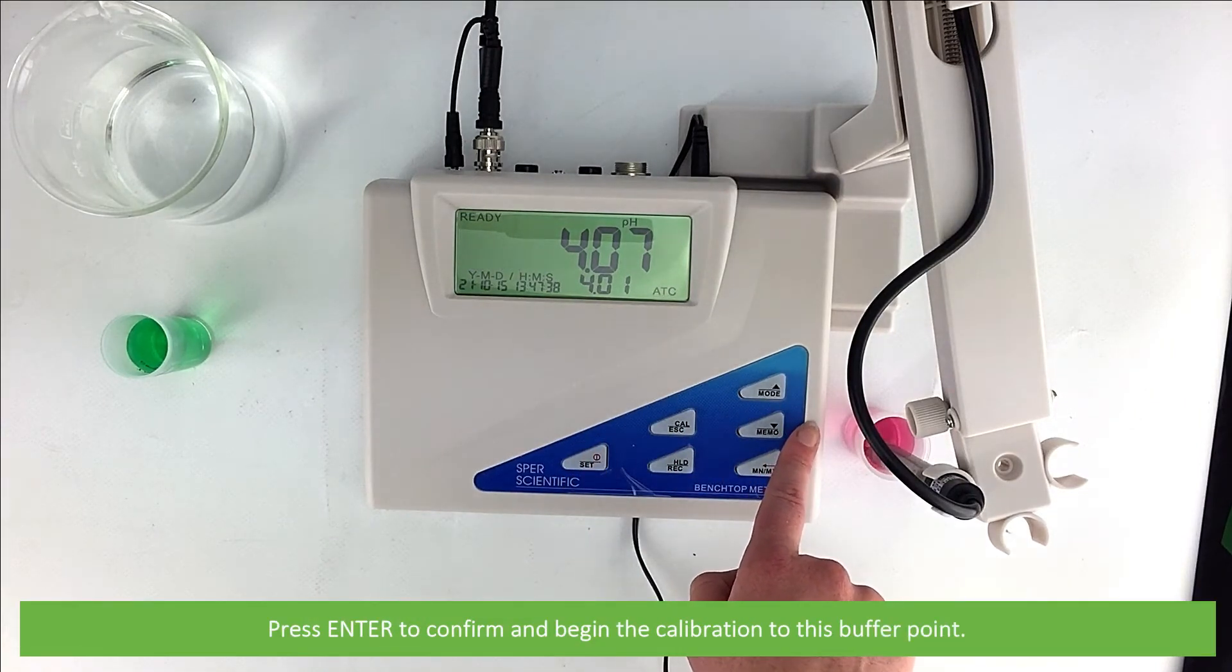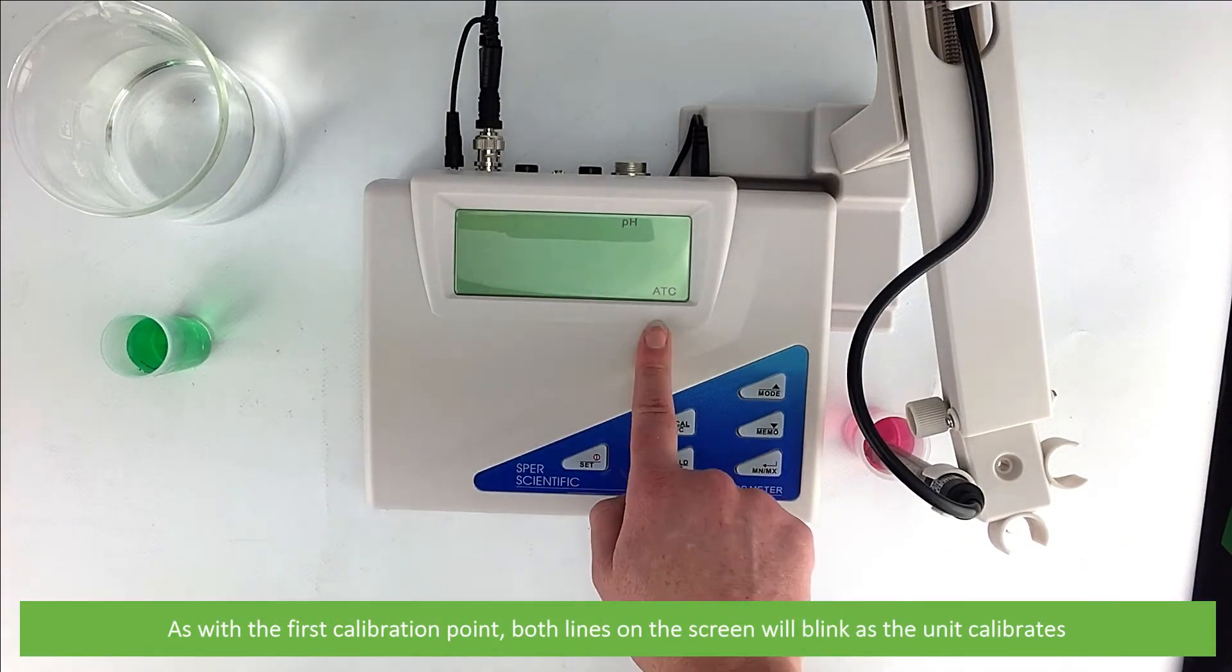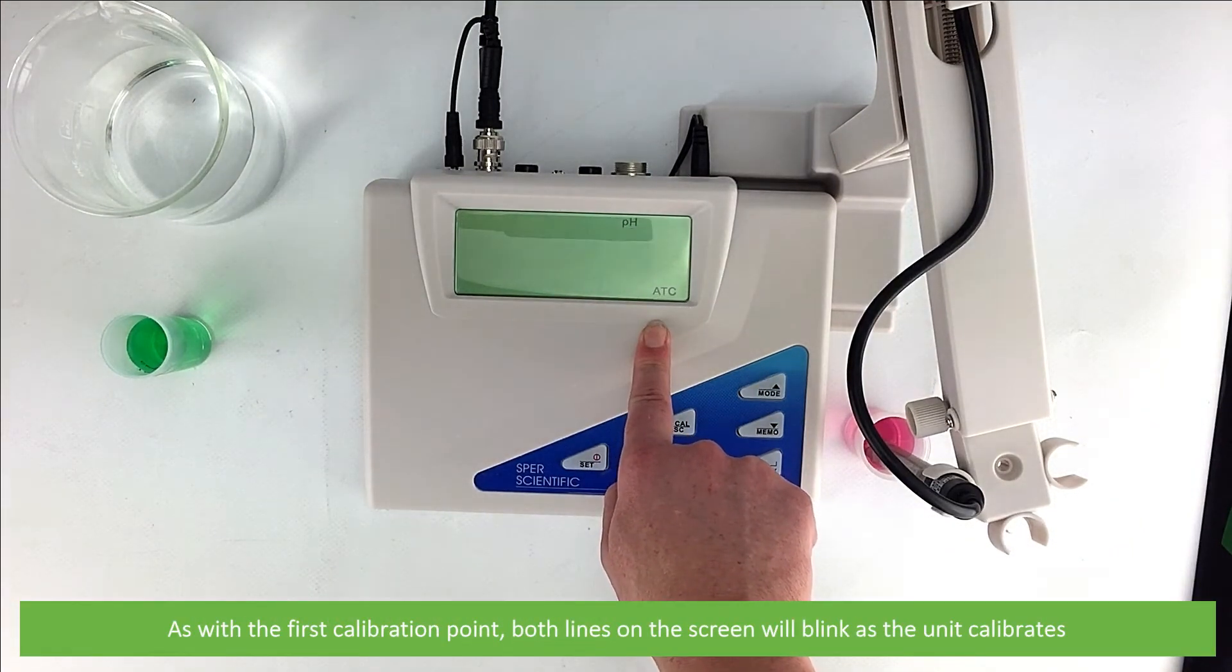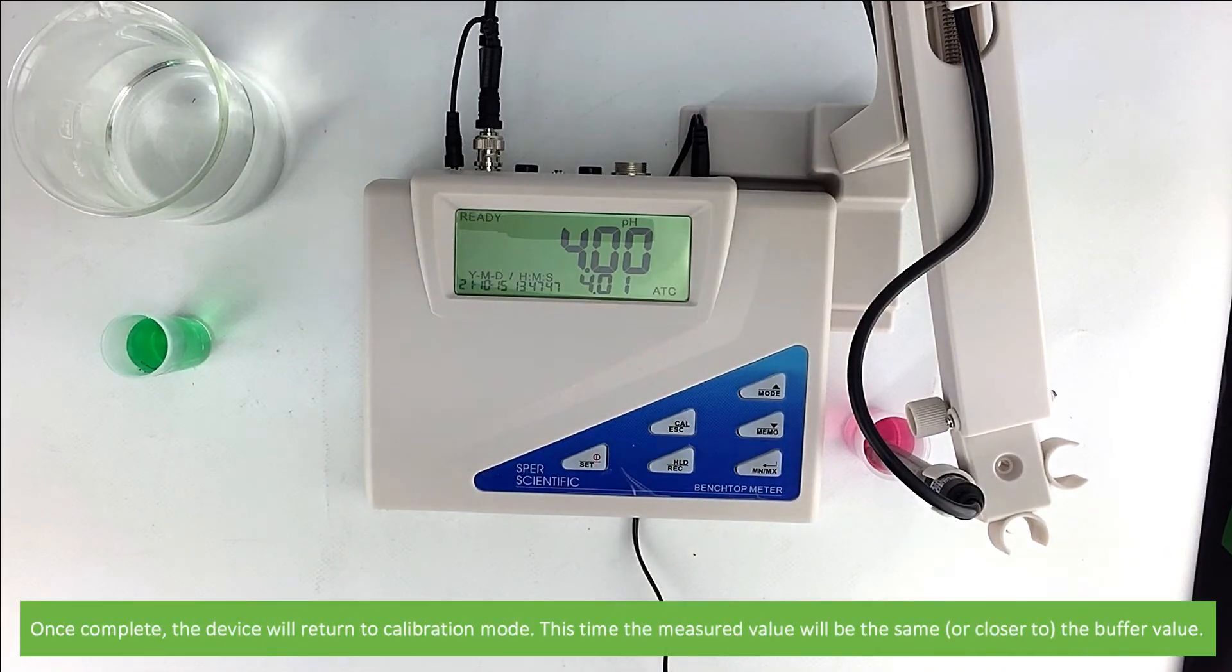Press enter to confirm and begin the calibration to this buffer point. As with the first calibration, both lines on the screen will blink as the unit calibrates. Once complete, the device will return to calibration mode.